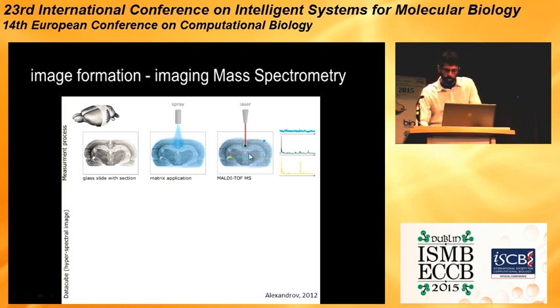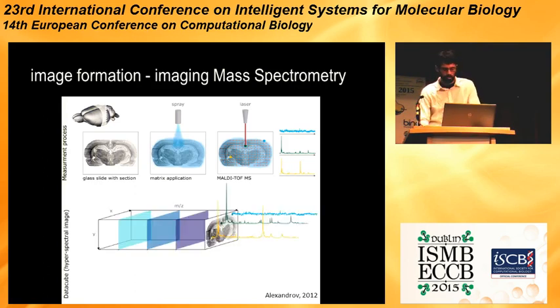And you can see here, if you collect spectra from different points on a sample, which is color-coded here, you get very different spectra according to the composition of the sample at that location. We build this up into an imaging modality by collecting spectra at every point across this grid. These then get combined together into a hyperspectral data cube. Every pixel here contains a complete mass spectrum in this X and Y dimension, and then along this chemical axis you have the intensity of all of these points. So if you slice the cube here and plot the intensity of a particular peak over the image, you end up with the chemical distribution of that molecule within the sample.